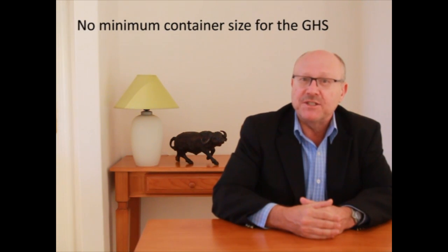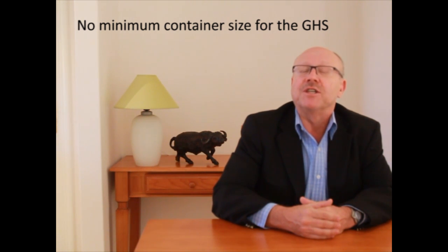For those of you scientists out there who think you might be able to avoid the GHS radar and its associated challenges, because perhaps your containers are too small to qualify, think again. Bad news is there are no minimum quantity container sizes stipulated in the GHS guidelines. So it's extremely difficult to determine whether or not your minuscule container should be labelled or not.